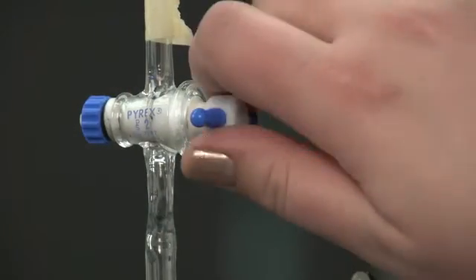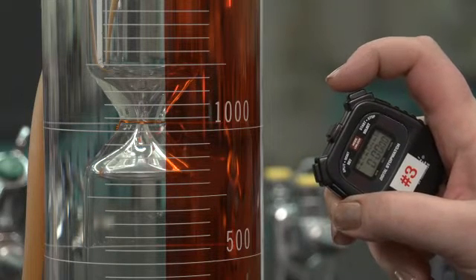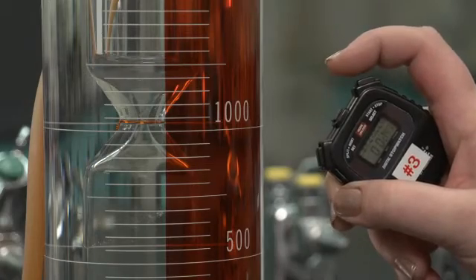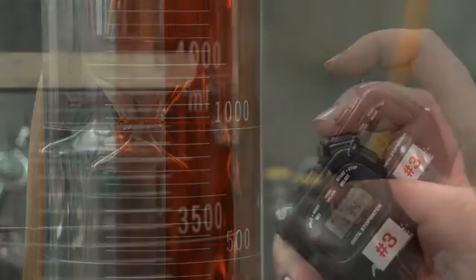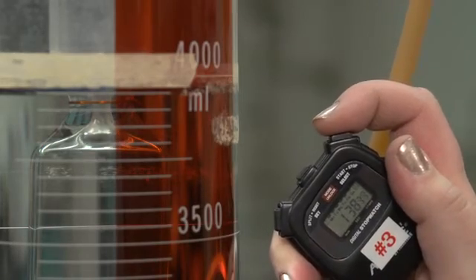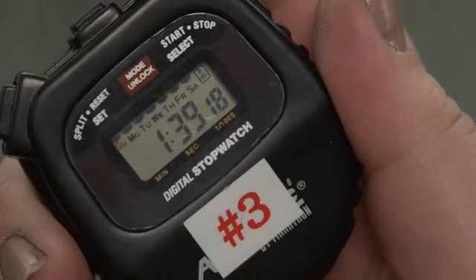When ready, open the stopcock to the effusion hole. Start the stopwatch when the water level is even with the lower constriction. Stop the stopwatch when the water level reaches the upper constriction. Record the time to the nearest one hundredth of a second.